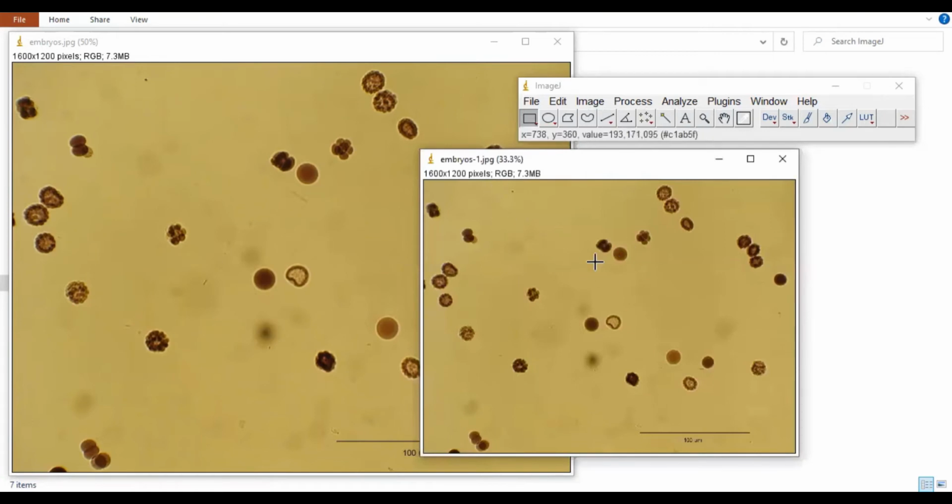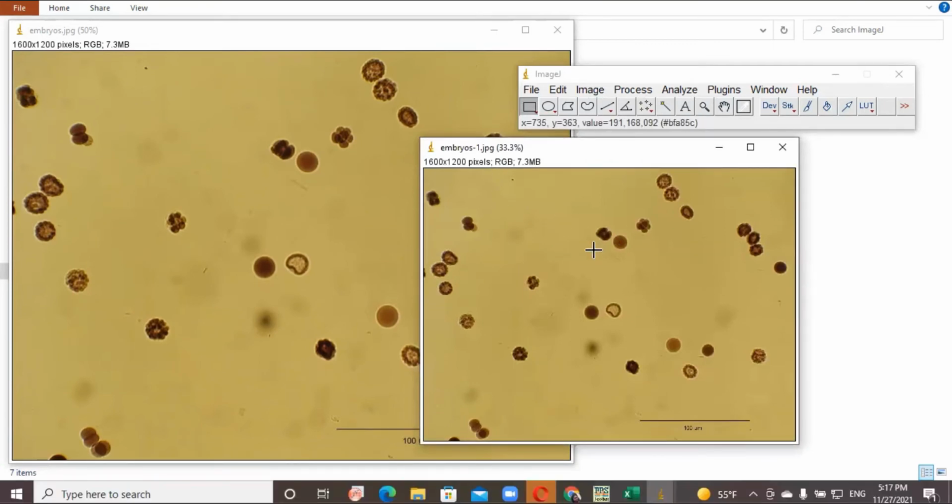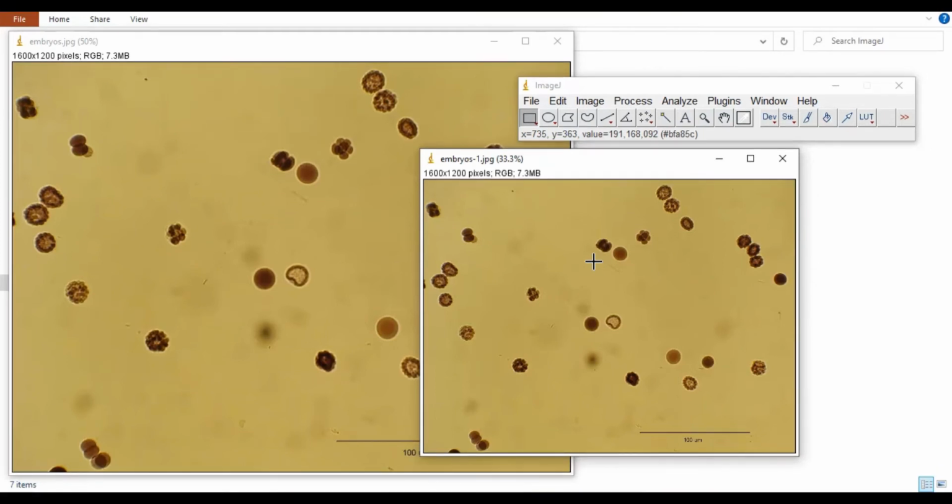Here we have it. In my previous video titled Surface Roughness Calculation, I mentioned 3 factors which one needs to consider when carrying out image processing. Filtration: you have to make sure that your particles are smooth and the quality is high.